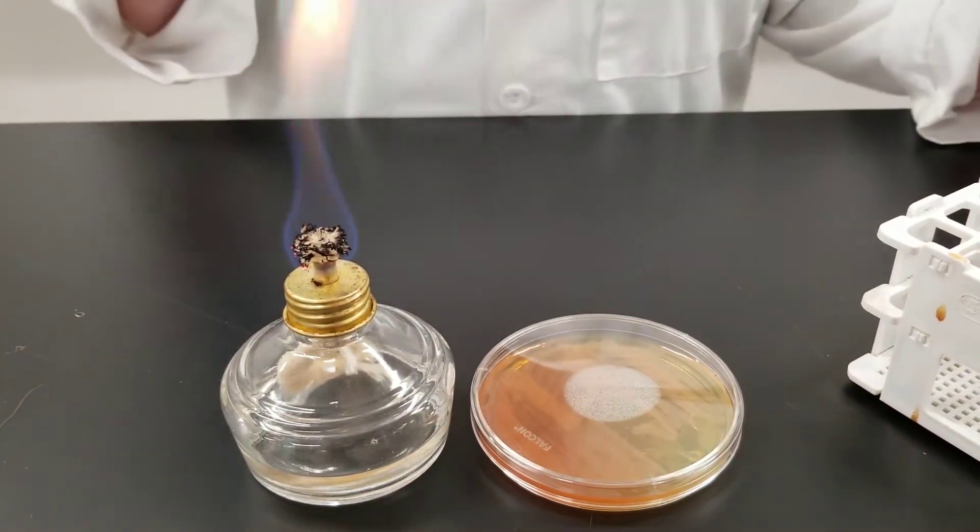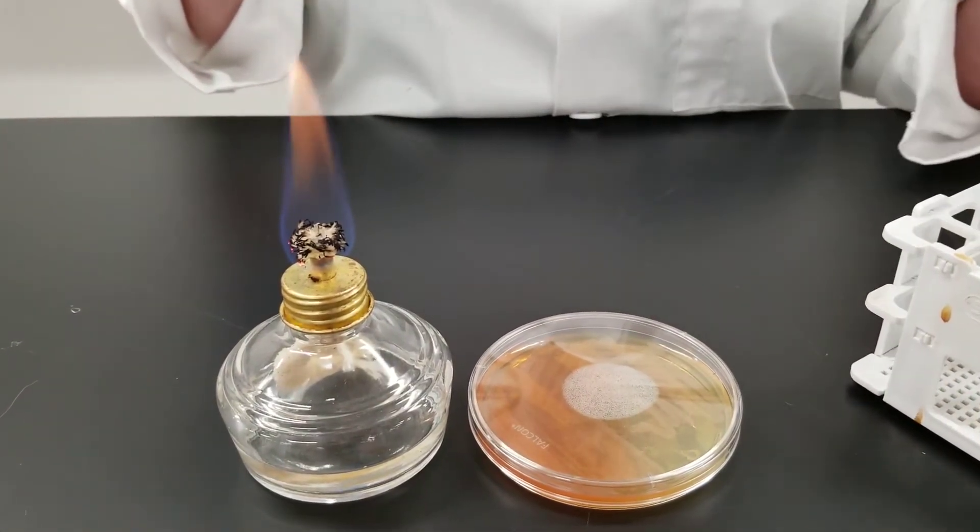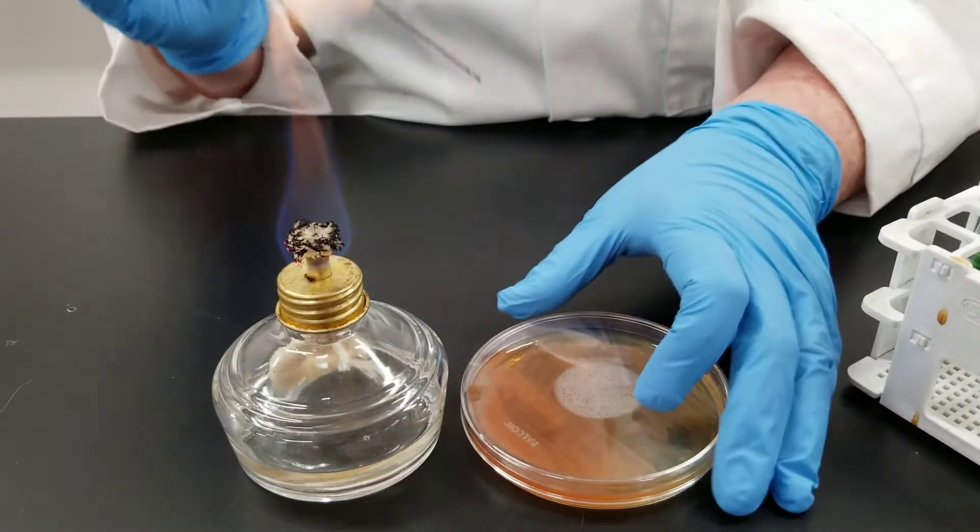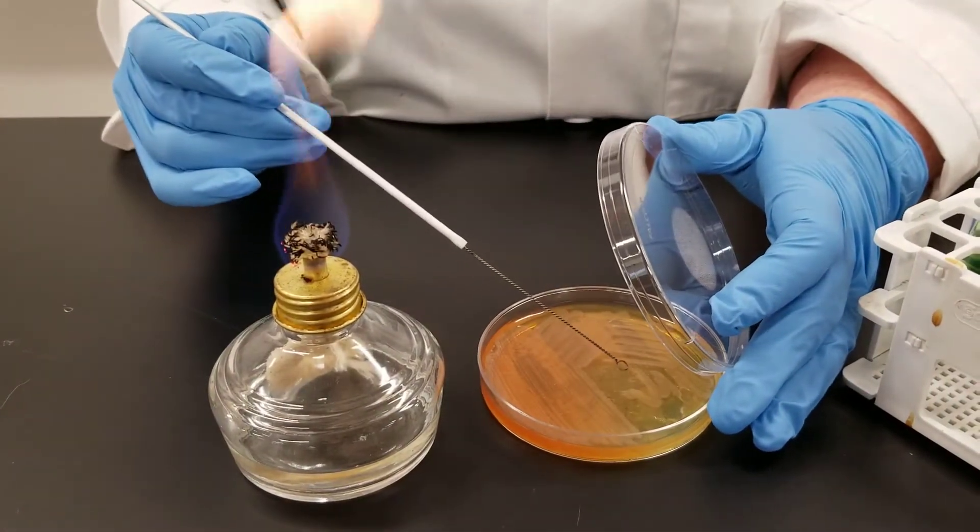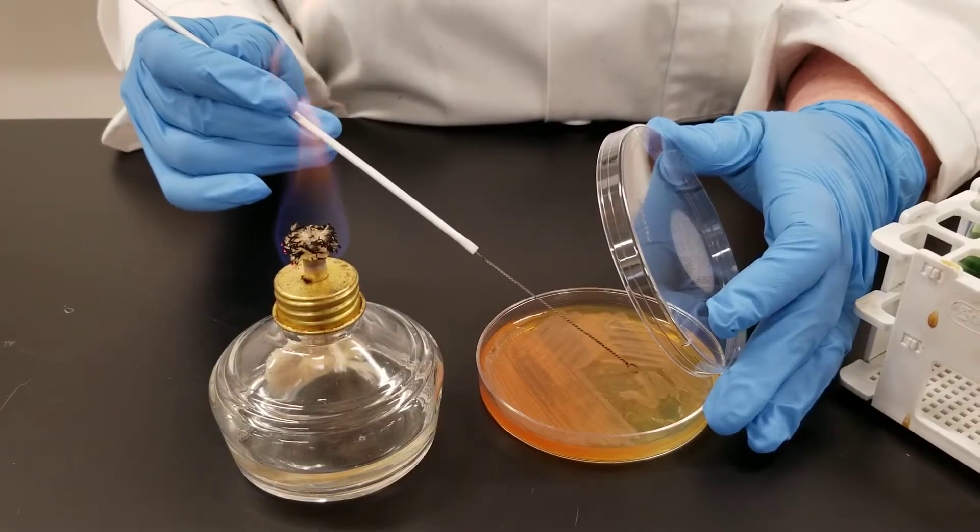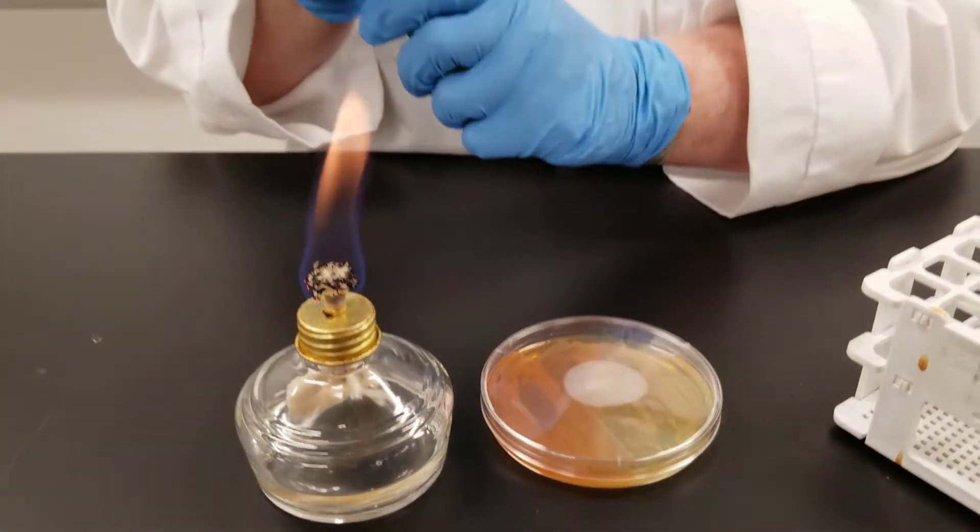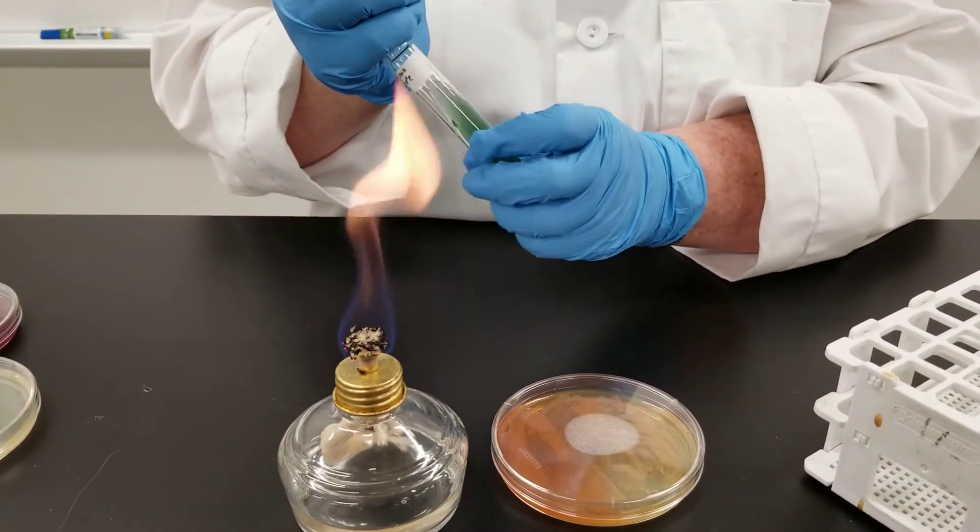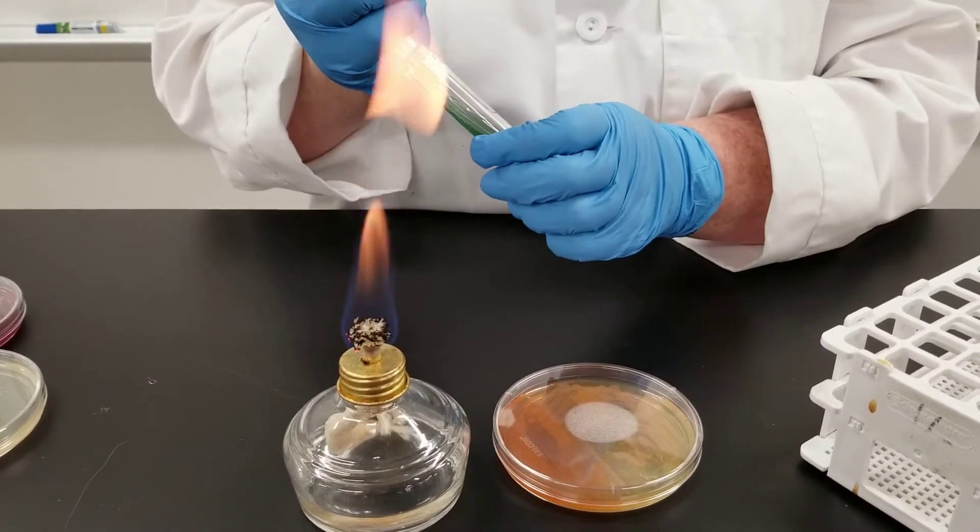Now what I'm going to do is inoculate a slant. This is a Simon citrate slant. I'm going to inoculate that once again going from this stock plate. By the way, the bacteria we are using is Pseudomonas aeruginosa. It is a gram-negative organism commonly found in the soil. It can also cause various infections in humans.